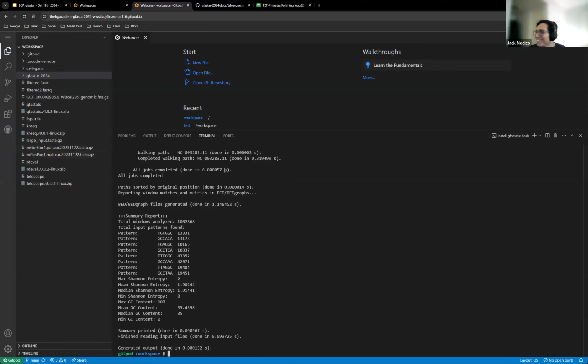So we can rerun this, I can just delete this, it doesn't matter. I can change this to 150 or 200 if I want. It's going to do the same, it's gonna take a few seconds.